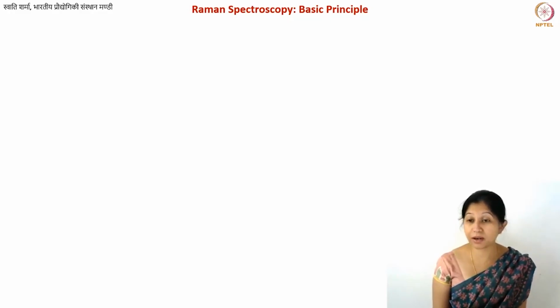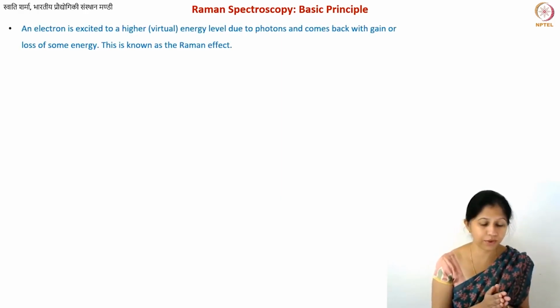In this lecture, we might not go too much into the details of the Raman spectrum of graphene. I'll tell you the fundamental things, but we may not go into too much detail because the materials that are more important in this particular course are the bulk carbon materials. So we'll be focusing more on the Raman spectrum of graphite and of disordered carbons and the origin of some of the peaks. Let's see how much we can cover and how much we can understand. So we start with the very fundamental aspect.